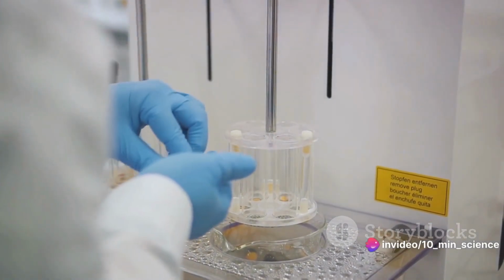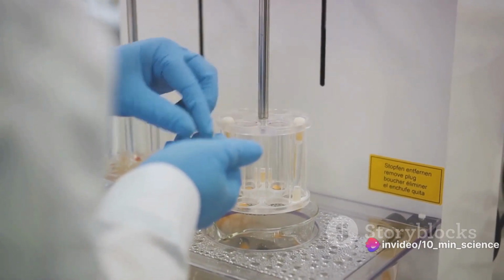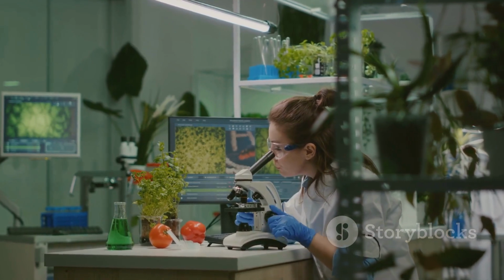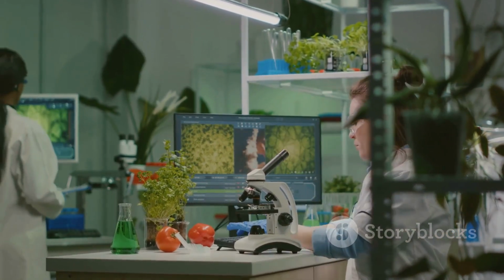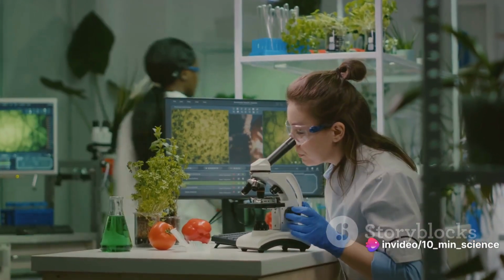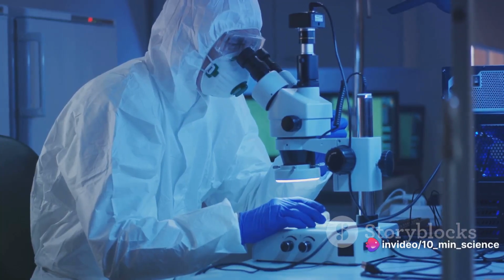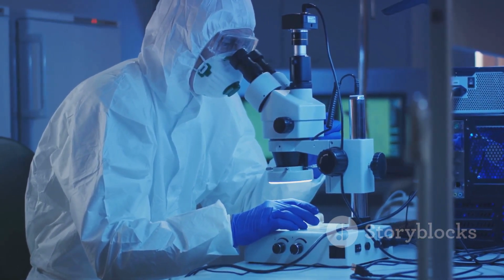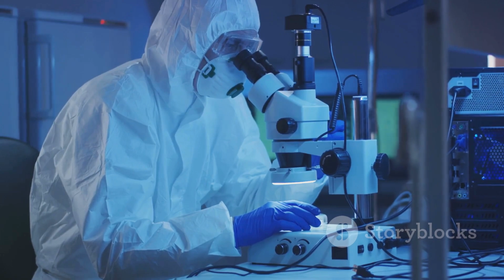The report is a comprehensive document that details every aspect of the assay. It includes information about the sample, the assay procedure, and of course, the interpretation of results. It's the document that communicates our findings to the world. In the pharmaceutical industry, these reports are vital. They provide evidence of the quality and safety of products. If a product fails to meet the required standards, the report will highlight this, prompting further investigation and potentially saving lives. And there's one more thing.